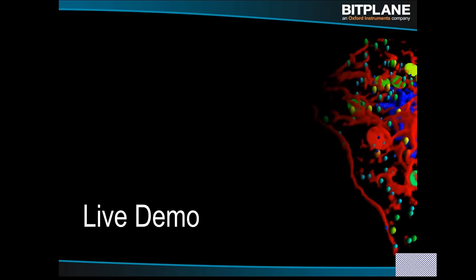Okay, and with that, we'll switch over to the live demo, and I'll give you a little bit of an overview of the workflow through Imaris.